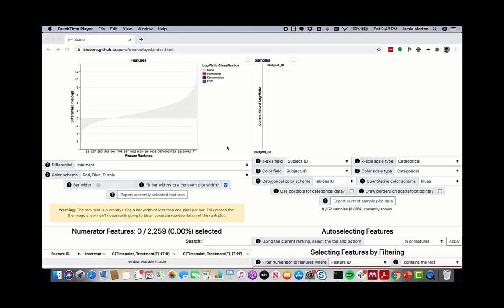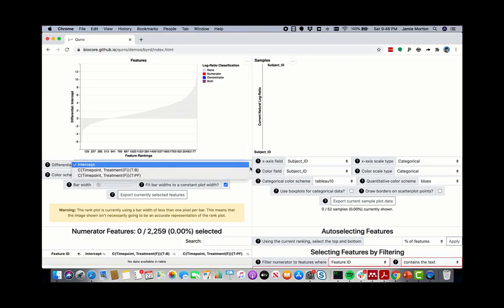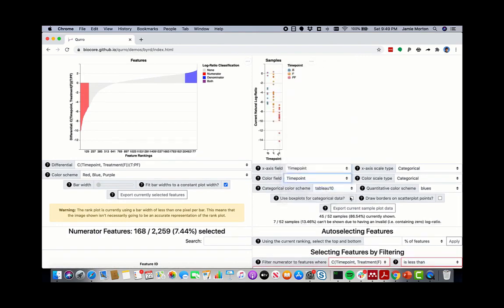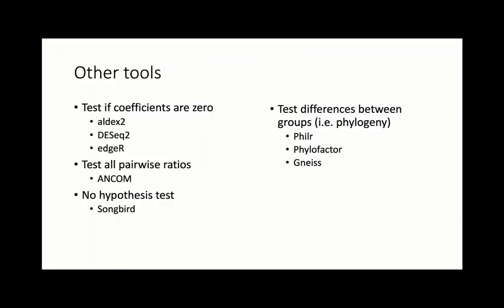Once you are satisfied with your model, you are ready to start considering hypothesis testing. Unfortunately, how to best perform hypothesis testing is still an outstanding question, but we can perform statistical hypothesis testing on individual log ratios. Here is an example of how such an exploratory analysis looks in an interactive tool called CHIRO, where ranks estimated from the generalized linear model can be linked to log ratios where the statistical tests can be performed.